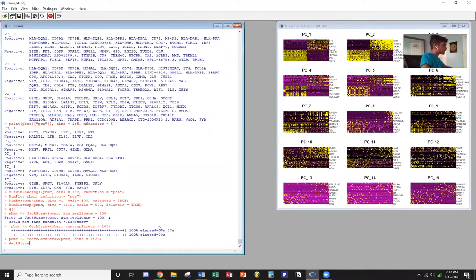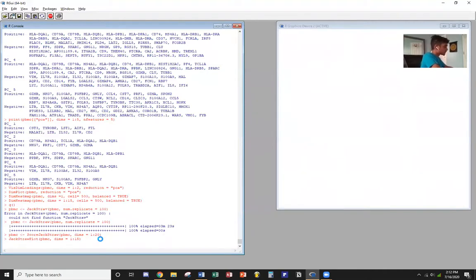Whenever it takes a long time for a certain code line to give an output, I will be pausing it. It seems I did not click the pause button, so yeah, I'm new to recording using the software, so please bear with me.